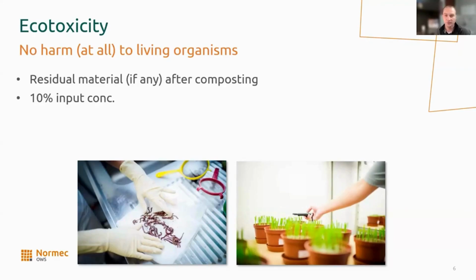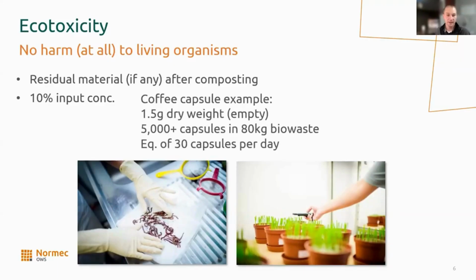When we make compost for ecotoxicity, we do that with a 10% input concentration of the test material, which is a very high concentration. And to give a quick example of that, using a coffee capsule example, a typical coffee capsule weighs about 1.5 grams on dry weight basis.